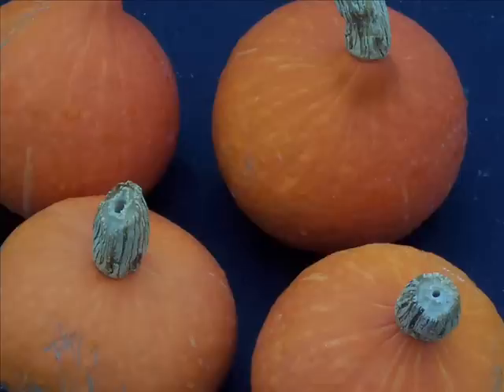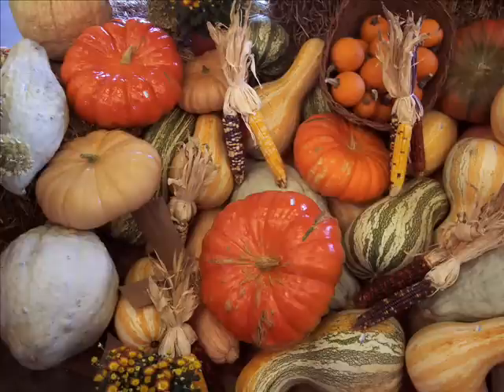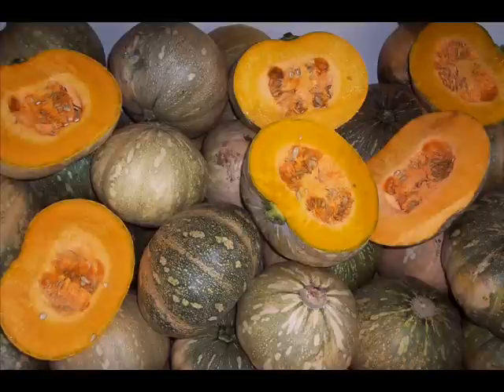In this series of slides, I will be demonstrating the process using plants of tropical pumpkin from a breeding program at the University of Puerto Rico at Mayaguez. This particular species is Cucurbita moschata and includes the butternut squashes. However, the same technique can be used for any Cucurbita species.